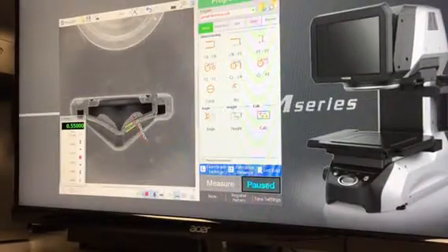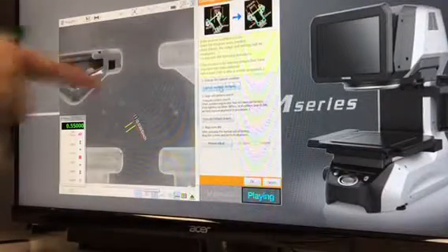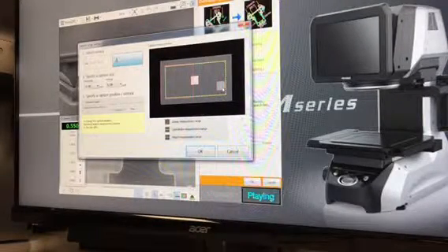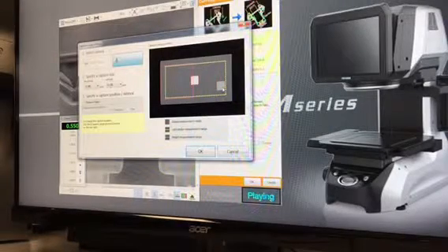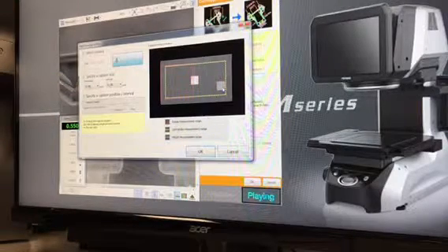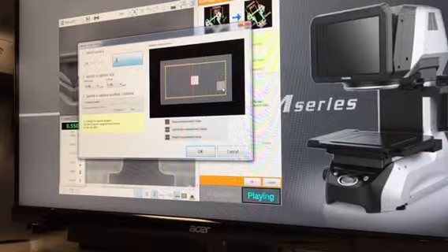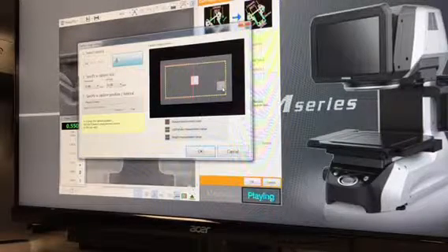And then if you hit start preview, that thing, when you edit something you probably move or bump the part. So to go back to where you were, just click the capture. And this will allow you to adjust the window, make it bigger, or whatever. And then from there, you can just highlight the measurement here and copy it on to the next one.